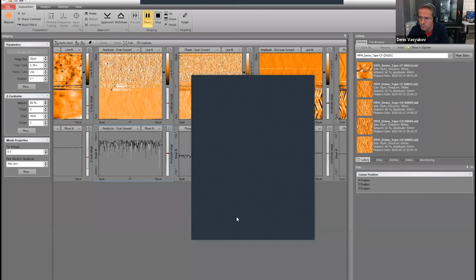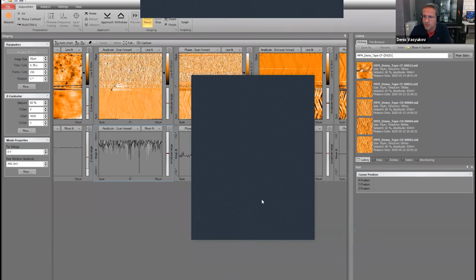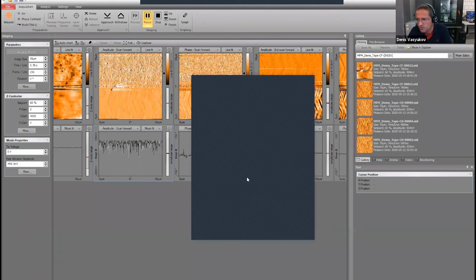Is it possible to inject spin current into the material and see how the spin is preserved in the material using MFM? And measuring spin current induced magnetization. Yeah, I know these measurements are very difficult.